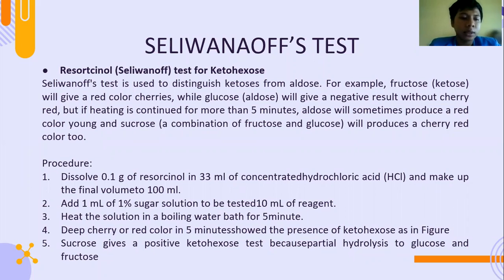And third, heat the solution in a boiling water bath to get a cherry red color in 5 minutes, showing the presence of ketose. And the last one, sucrose gives a positive ketose test because of partial hydrolysis to glucose and fructose.